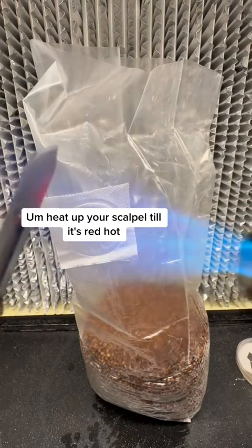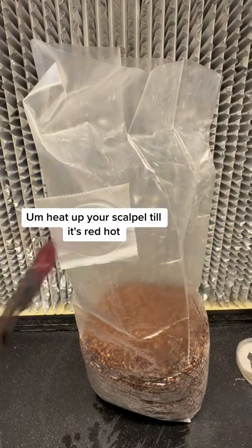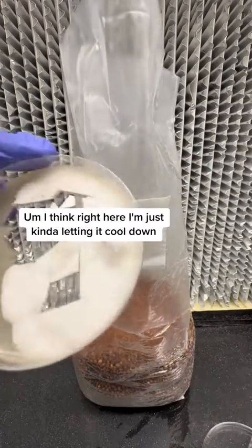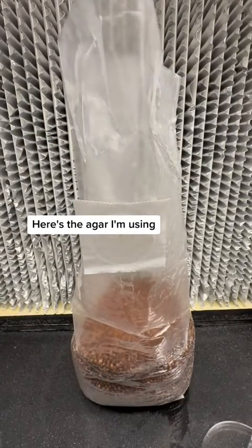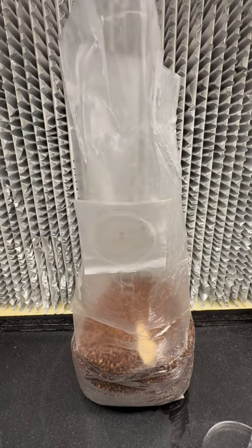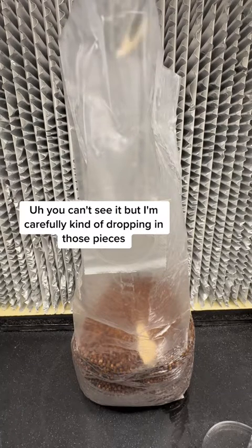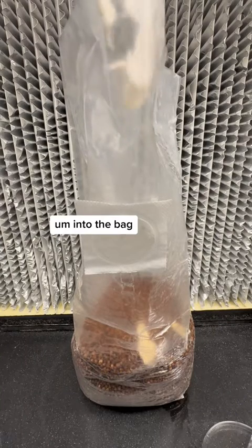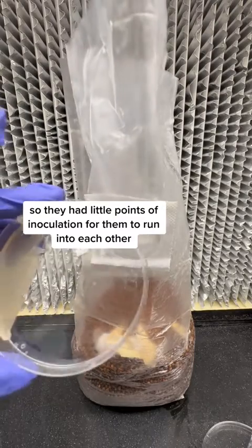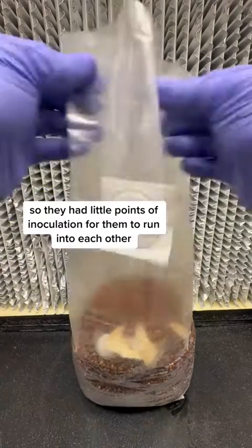Heat up your scalpel till it's red hot. Right here I'm just kind of letting it cool down. Here's the agar I'm using — pieces of it are missing because I used it for a liquid culture. You can't see it but I'm carefully dropping in those pieces into the bag. I cut them up a little bit so they had little points of inoculation for them to run into each other.